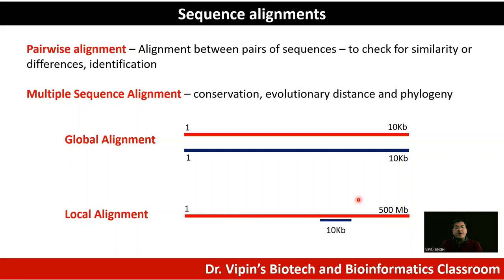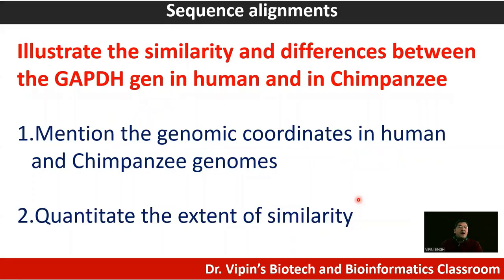Here is our task: illustrate the similarity and differences between the GAPDH gene in human and in chimpanzee, mentioning genomic coordinates in both genomes and quantifying the extent of similarity. We'll first retrieve the GAPDH sequence in the human genome using the genome browser, then zoom into the orthologous locus in chimpanzee using BLAST, and look at the alignment to see how similar or dissimilar the two sequences are.